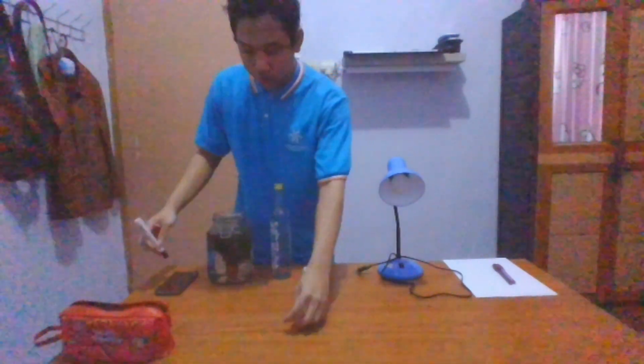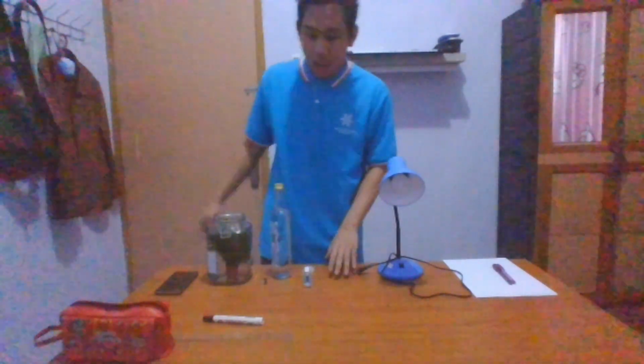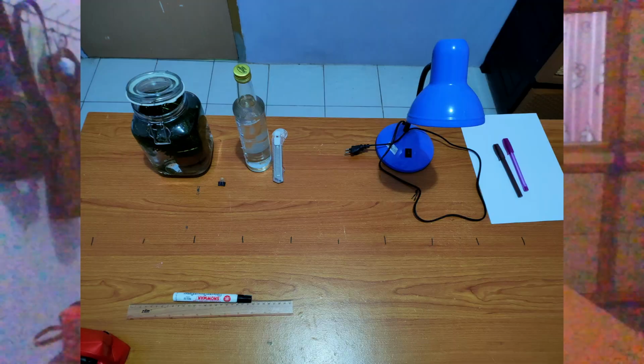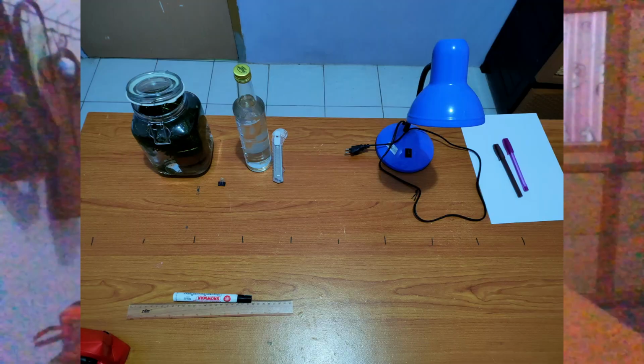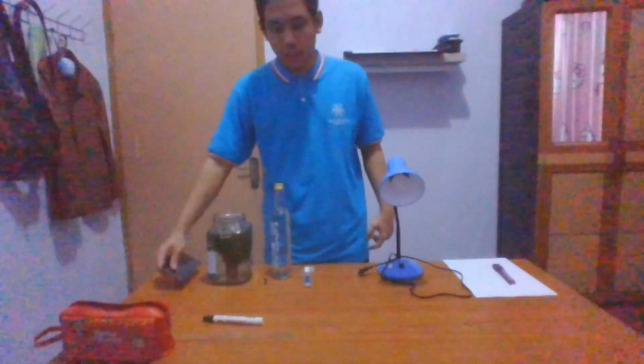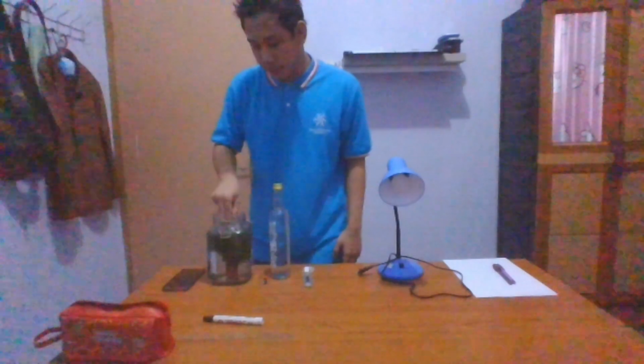This tool is used to make a distance difference. I have made lines on the table, which are separated 10 centimeters each. And finally, we have a phone to capture the video of the bubbles. Now, let's start the experiment.